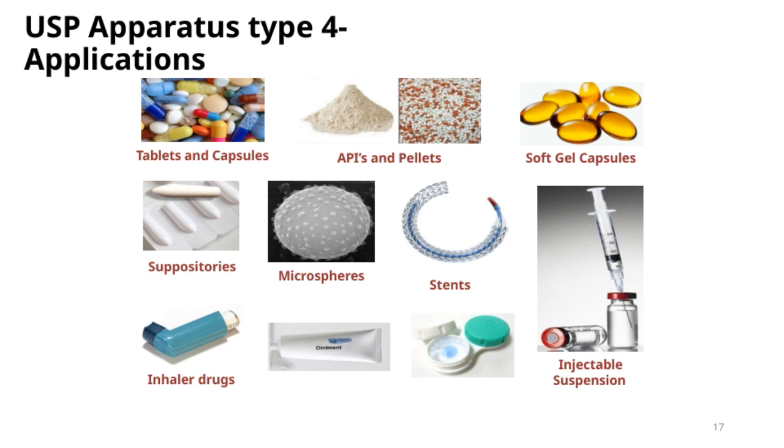to ensure consistent performance. Overall, the USP apparatus type 4 provides a flexible and reliable way to simulate the conditions these different drug forms encounter in the body, making it an essential tool in quality assurance across many dosage forms.